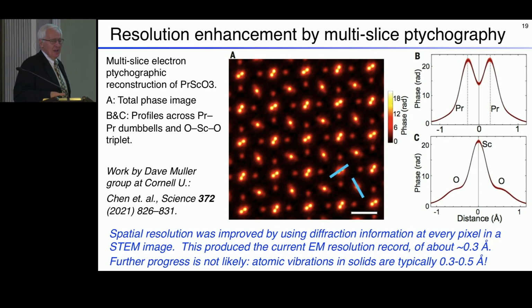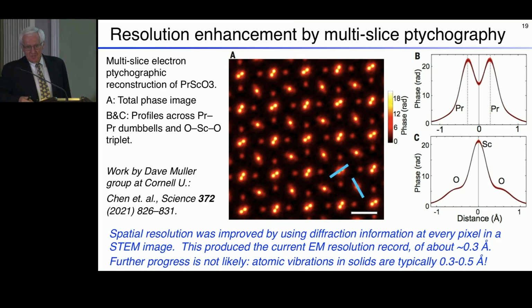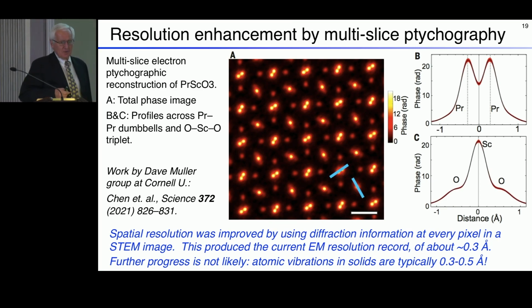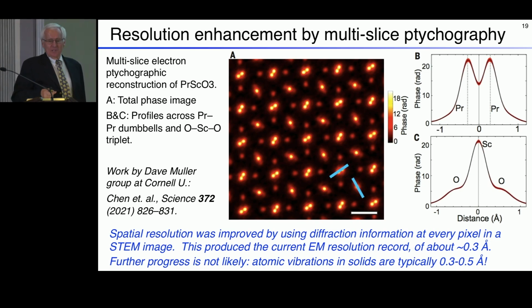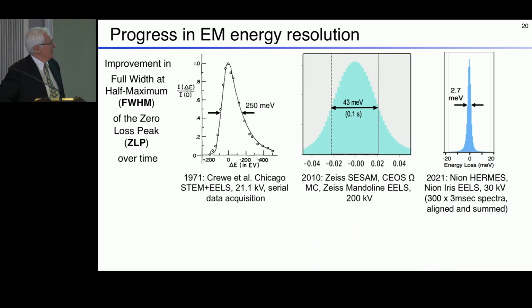microscopy images. Back in 1948, in a little book called The Electron Microscope, he wrote, when microscopy gets to 0.5 angstroms, the resolution may have to stop there due to lack of objects. So Mother Nature doesn't give us any objects to test resolution of microscopes that can do less than half an angstrom, and Gabor was 100% right. So we pushed it to 0.3 of an angstrom, but it's not going to go anywhere much further.